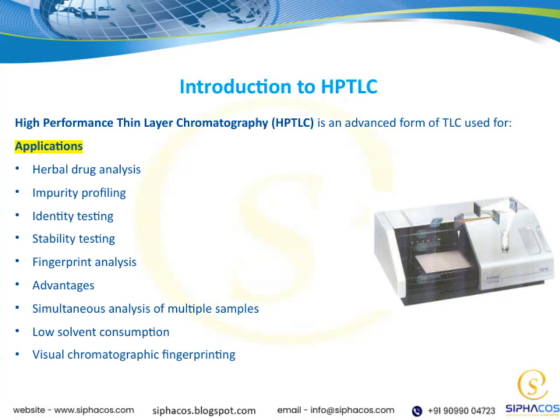Let's begin by exploring what HPTLC, or high-performance thin-layer chromatography, actually is. It's an advanced version of the traditional TLC technique, designed to provide more precise and reliable results. This method is used in a variety of important applications. For example, it's crucial in herbal drug analysis, helping us identify and quantify active compounds in botanical medicines.